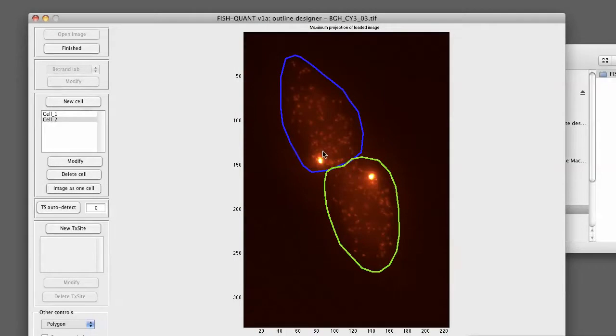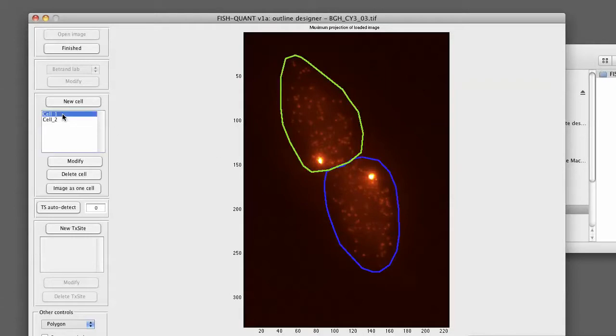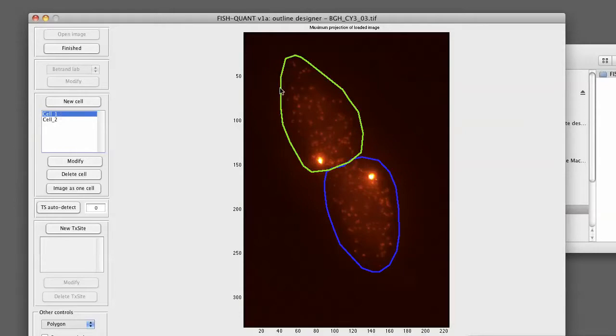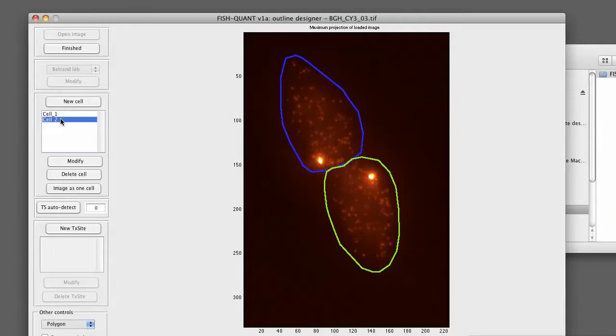Now we can define the two transcription sites. What's important here is that each transcription site is associated to one cell. This means that I have to first select the corresponding cell where I want to draw my transcription site. Then I can draw the site. I can select the cells from the list box. So if I select cell 1, cell 1 will be outlined in green. Accordingly for cell 2, the second cell will be outlined.